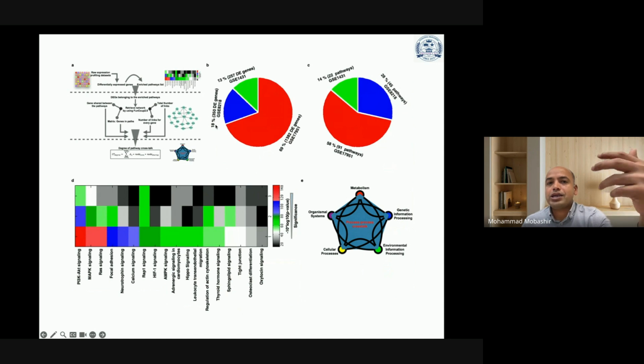If you want to go for classification, let's say you want to present a pie chart or some other kind of plotting, depending on how well you want to present. So basically, this is, for example, for one data set, GSE 8218, and another one here is for another data set called GSE 1431. And then I tried to present some of the best signaling pathways in different data sets and different types of cancers. This is just for presentation, so how good results you can present with complete clarity.